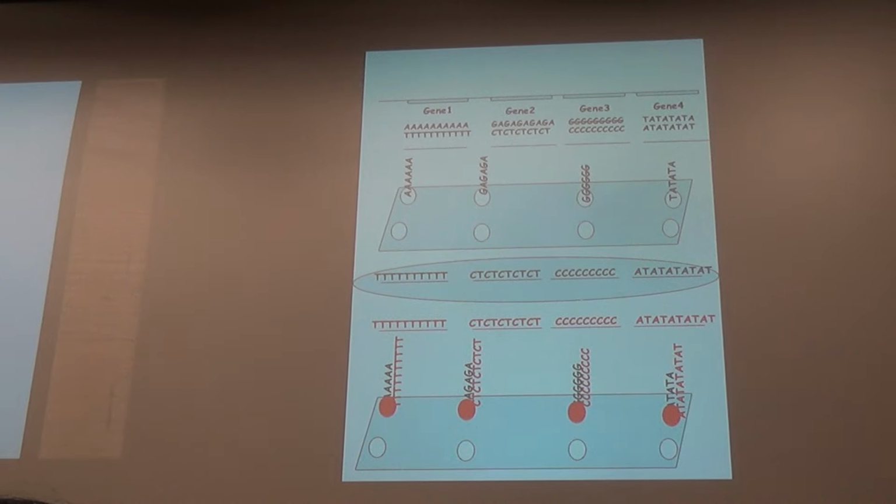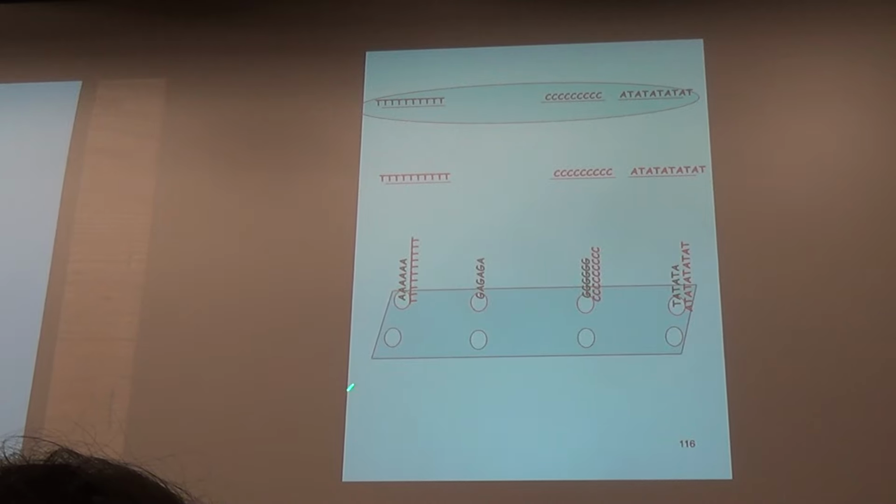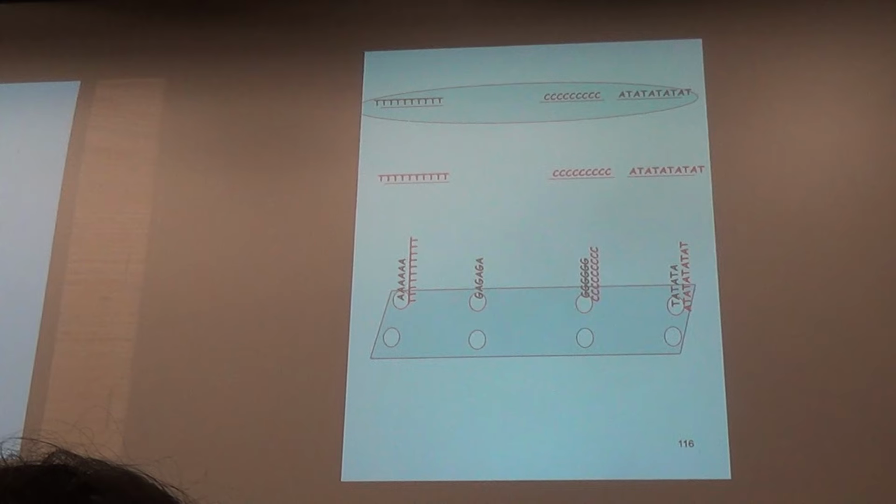In a totally different individual, if I were to isolate RNA, this individual is missing 1 gene. This gene is either being deleted or it's not being made into RNA or something. When you isolate RNA, make and label cDNA, you're going to hybridize it to the same sort of microarray.